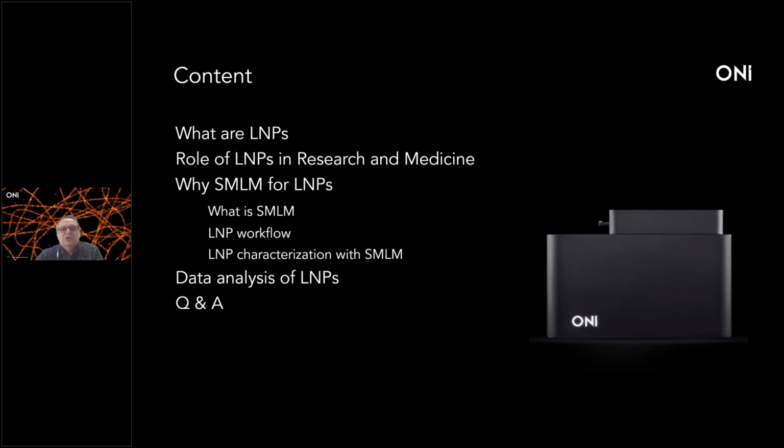With this introduction to lipid nanoparticles, I will introduce you to single molecule localization microscopy, and guide you through different workflows showing how it can help in your lipid nanoparticle research, and how you can advance your basic research before you move to clinical trials.